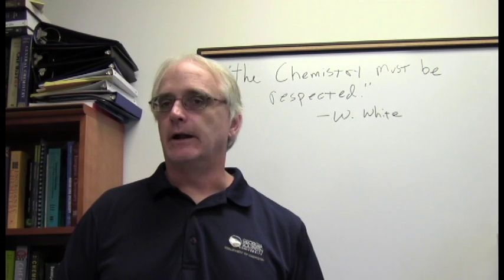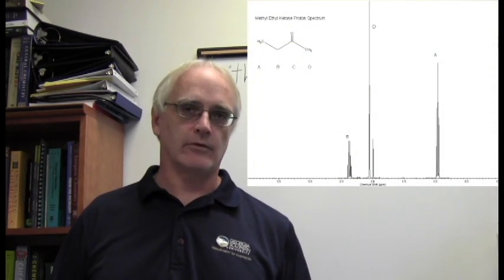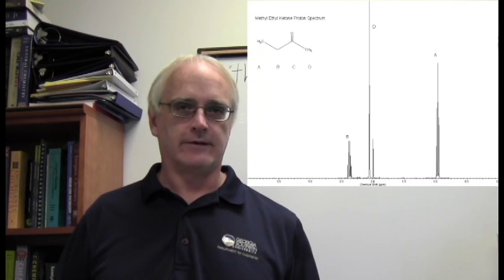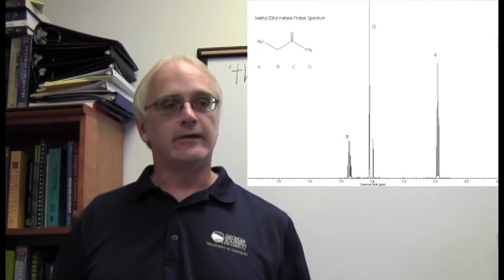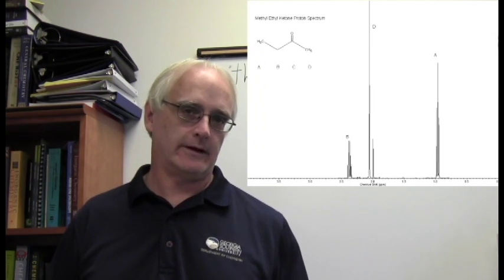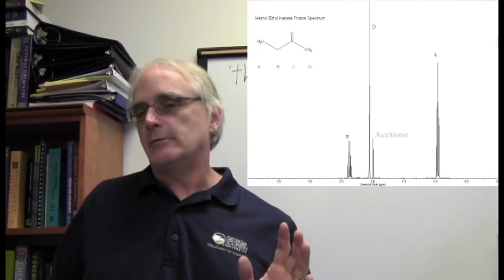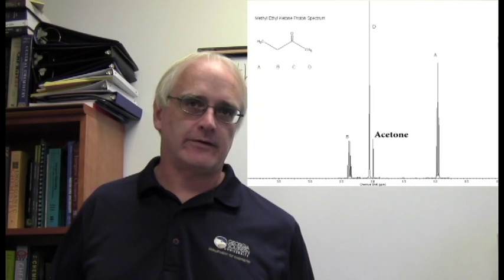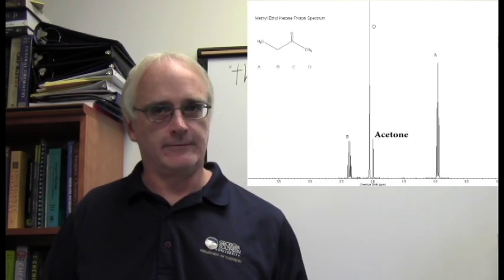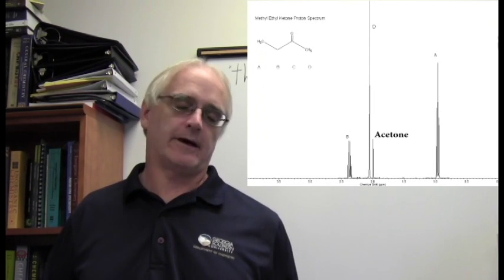And if we look at the proton NMR spectrum of this thing, sure enough we see 3 distinct resonances from it. It's interesting, methyl ethyl ketone, the commercial grade stuff we use when we make our standard, is actually contaminated with a trace of acetone. That's the way it comes when they sell it. And so we do see a 4th peak in there. It's very common to have contaminants, trace other materials, in our NMR spectra. It's something we just have to get used to from time to time. But it does show the 3 resonances we would have expected to see.